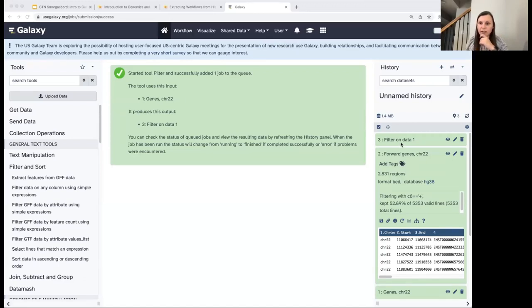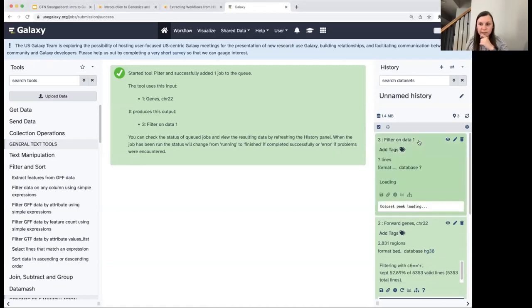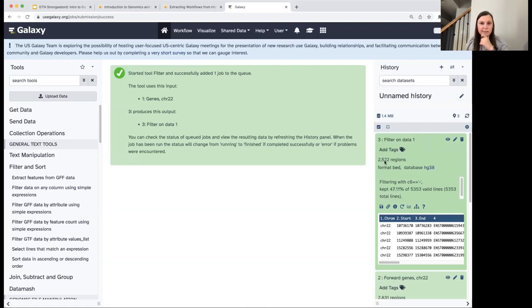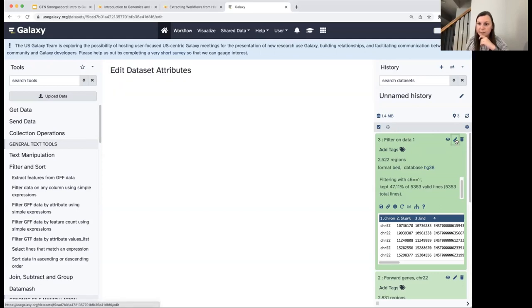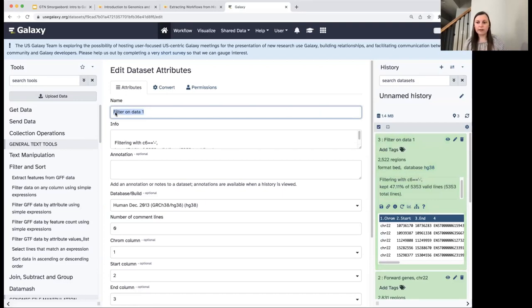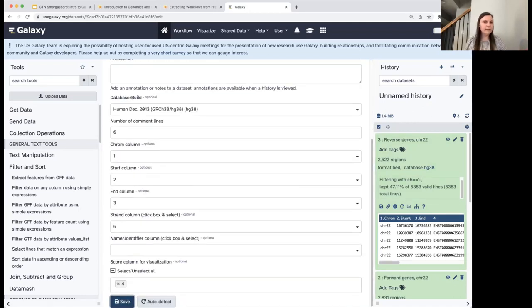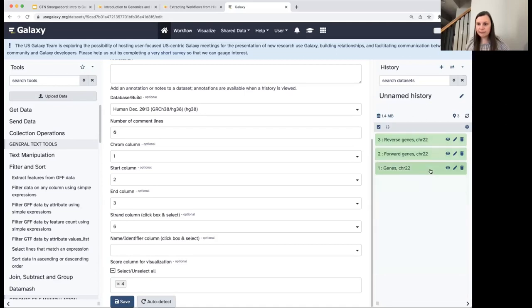The new job ran successfully. We have about 2,500 regions — the remaining 47%. So we've confirmed we've captured all genes on chromosome 22. I'll rename this dataset as 'reverse genes chr22' and save. Now we have forward strand genes and reverse strand genes. Next, we're going to check for overlaps between them.